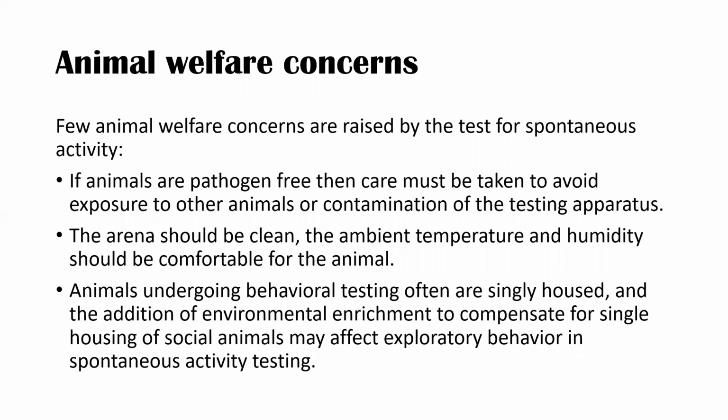So even though the apparatus we have for the automated assessment is very safe and gives precise results, there are still some animal welfare concerns that arise from this testing. These concerns are, number 1, if animals are pathogen free, then care must be taken to avoid exposure to other animals or contamination of the testing apparatus. The reason is that if you expose it to other animals, it might get some of their germs or pathogens. The apparatus itself should be very clean, and the ambient temperature and humidity should be comfortable for the animal, because external stimuli and environmental conditions have a prominent effect on the behavior of the rodent under observation.